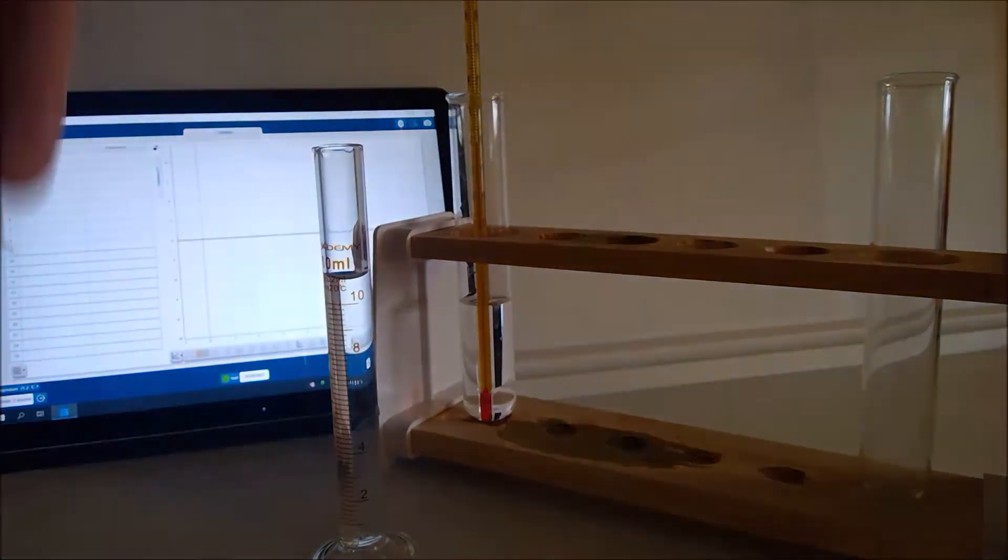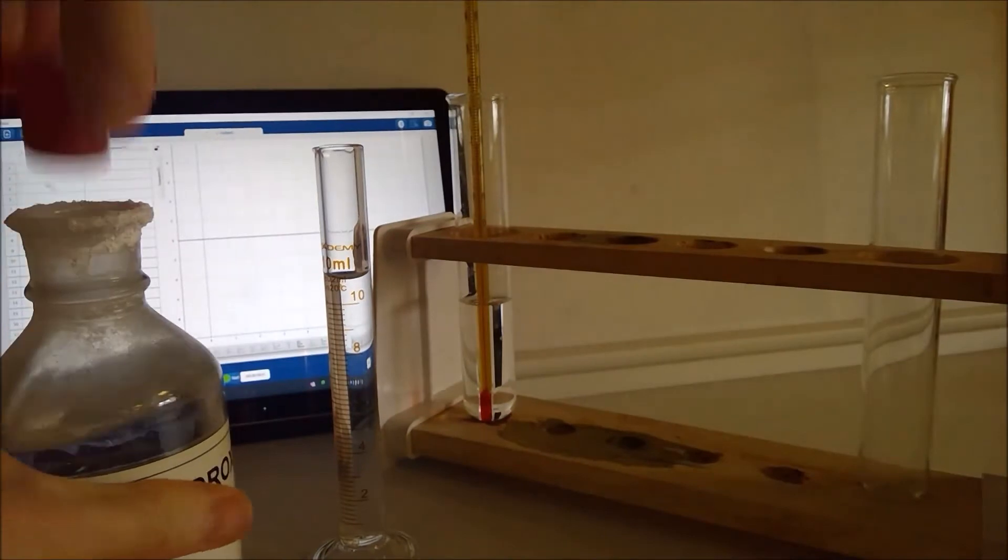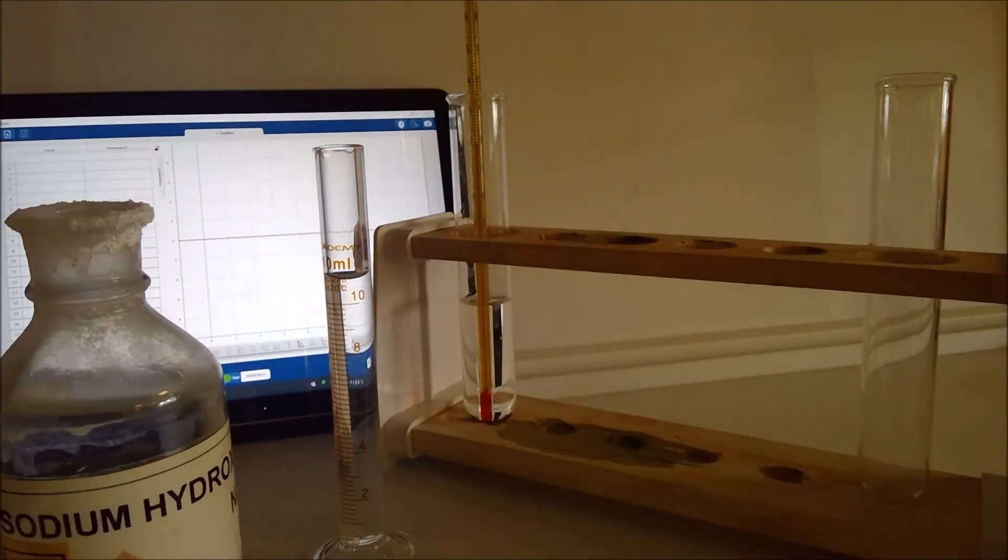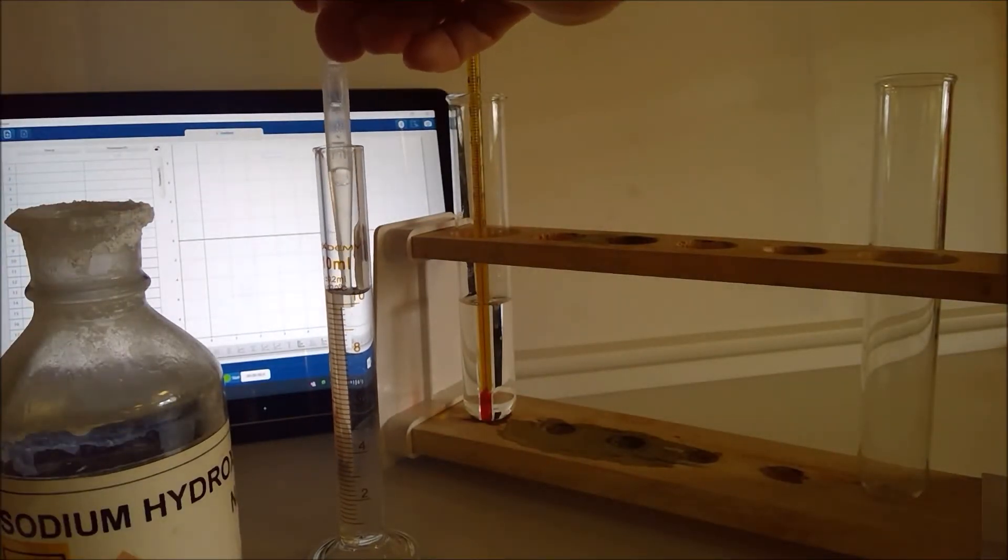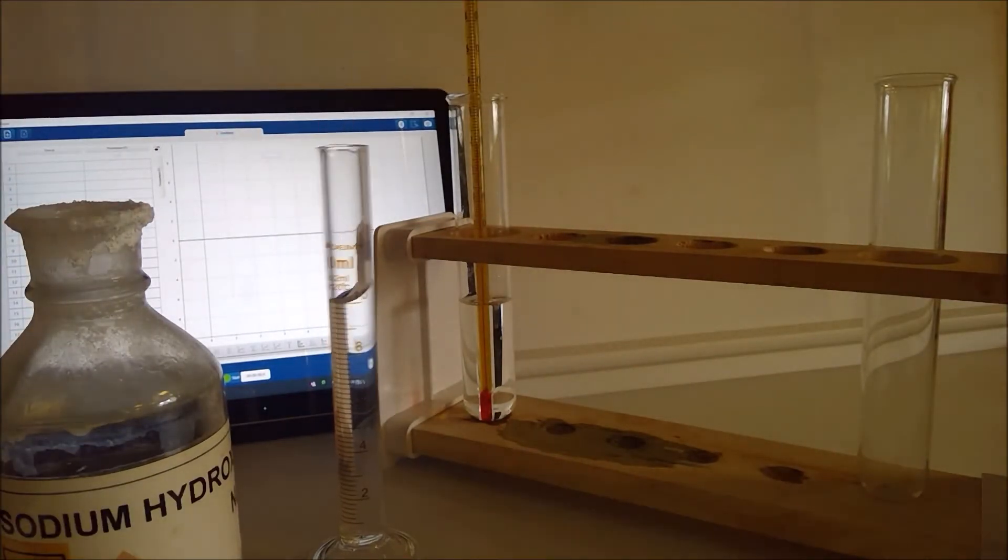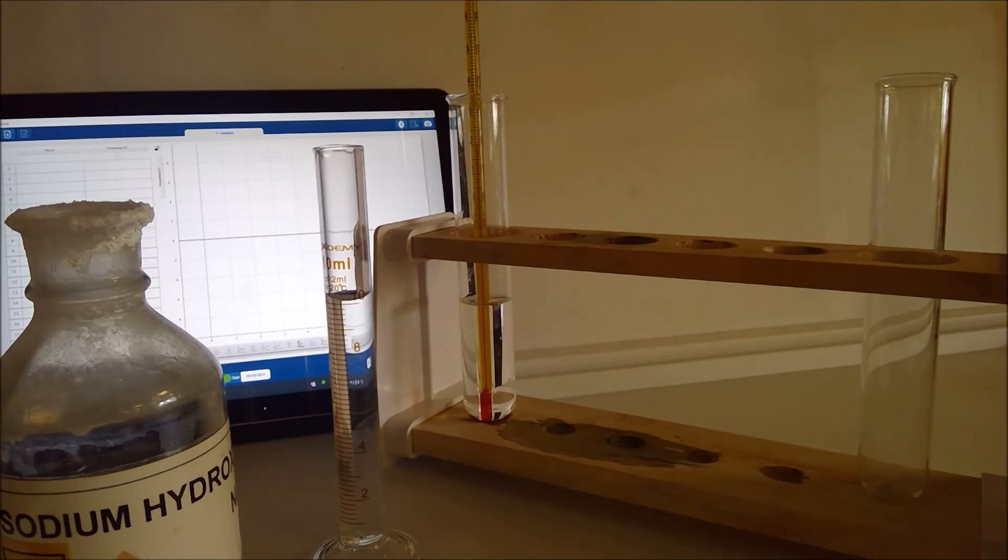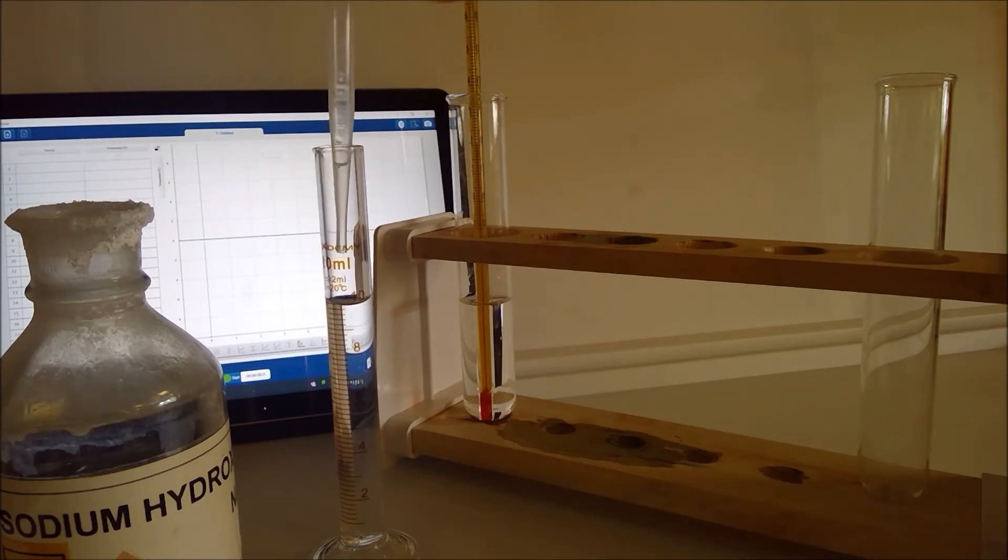And then with a clean dropper pipette just top it up so that the meniscus is bang on the 10 centimeters cubed line.